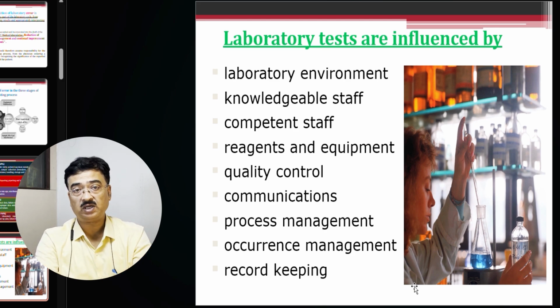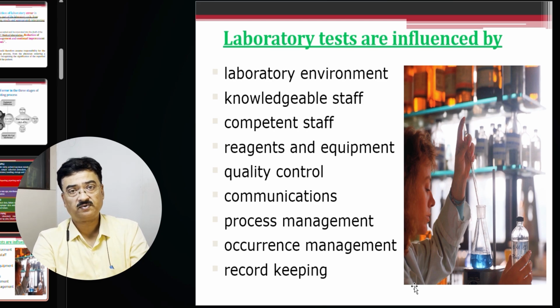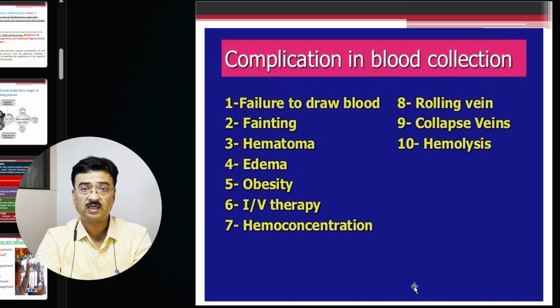A record does not only give a document of this test, but it is also one of the major sources of data from which you can analyze your fault and correct it.